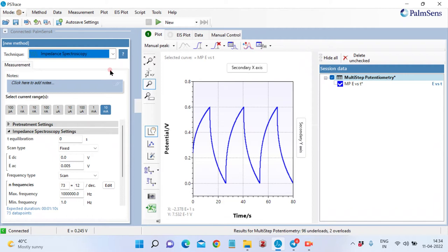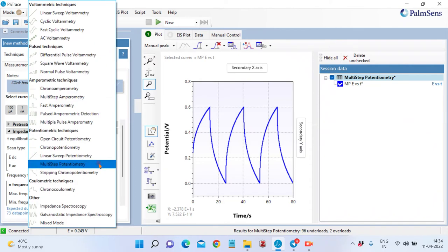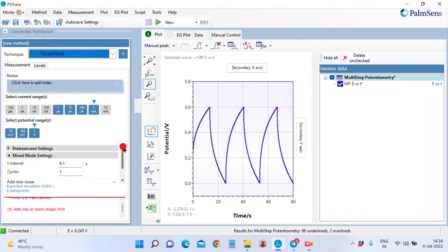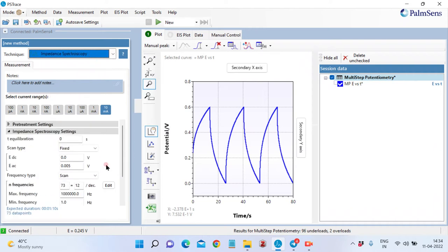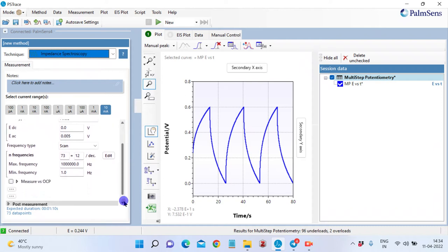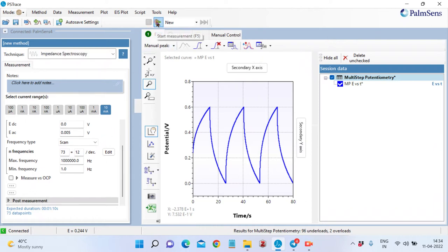For doing impedance spectroscopy, we need to select impedance spectroscopy and then select a potential. Here we are using 5 millivolts. Then we put the potential value here. This is the scan and the frequency range, which is minimum 1 Hertz to 1 megahertz. And we will start.